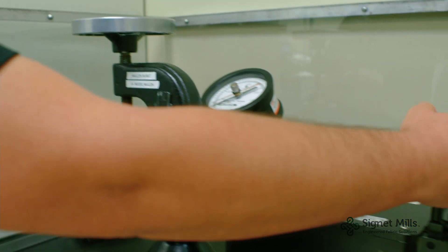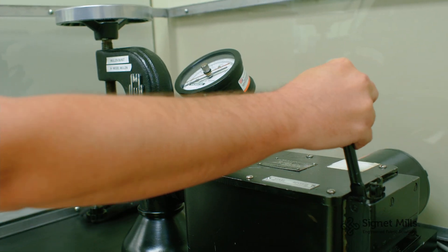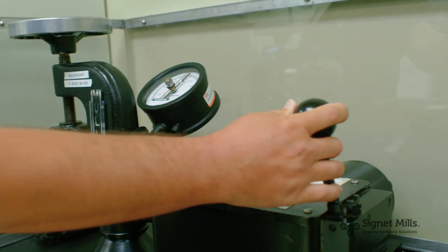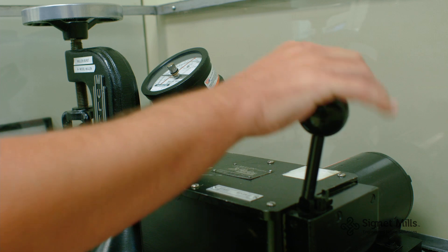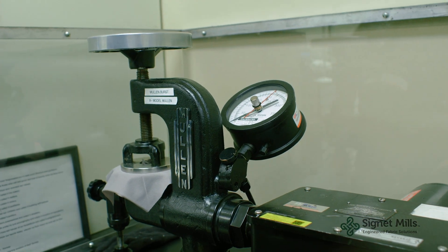So I'm going to demonstrate. Then you can read out your burst strength on the dial.